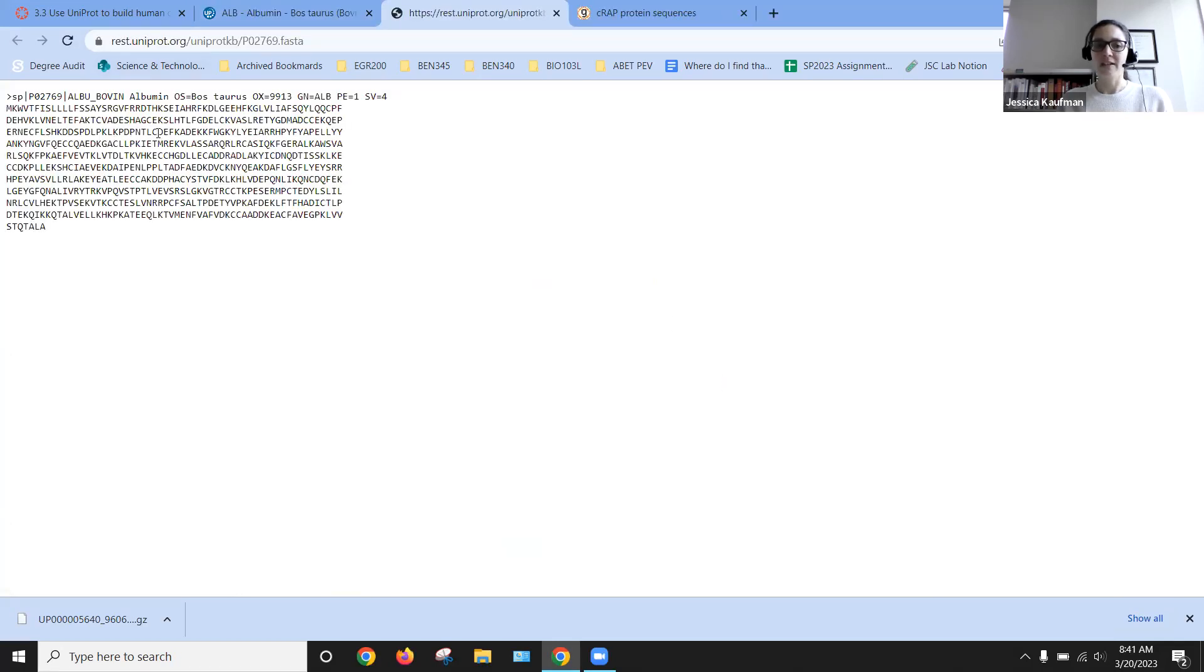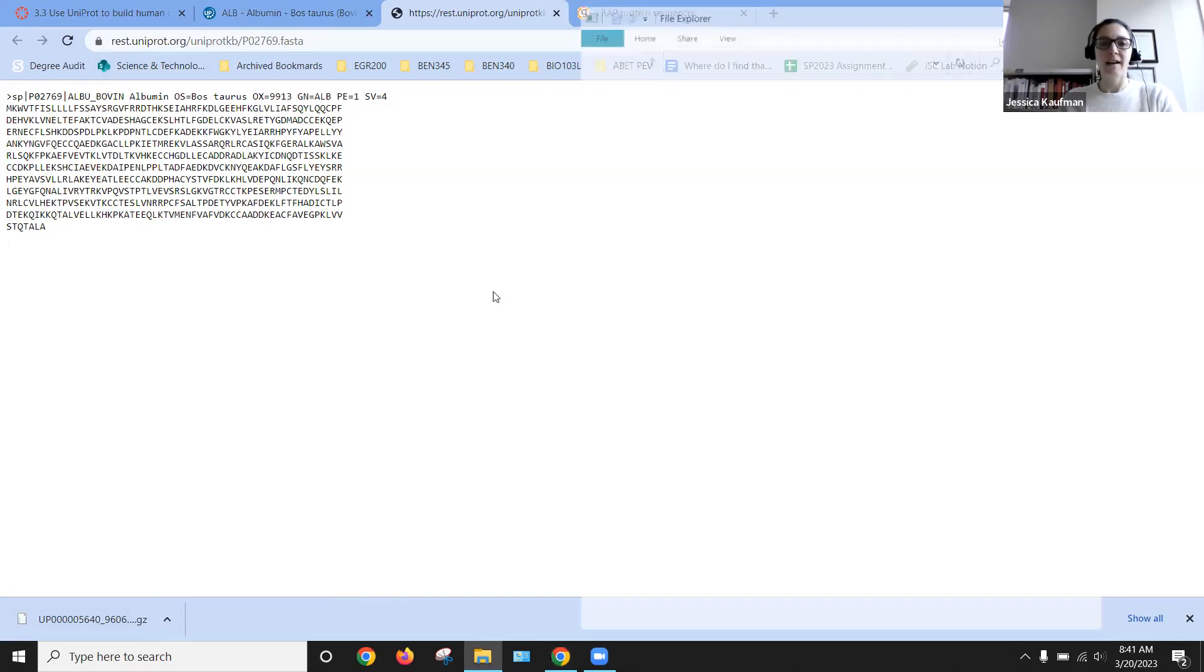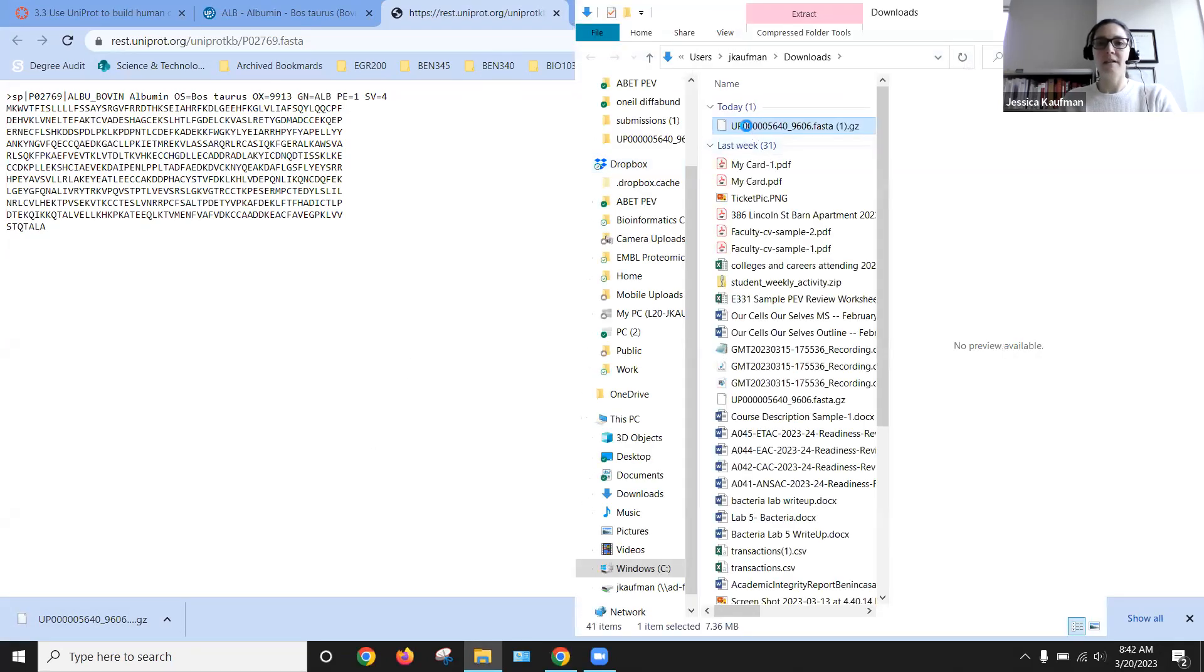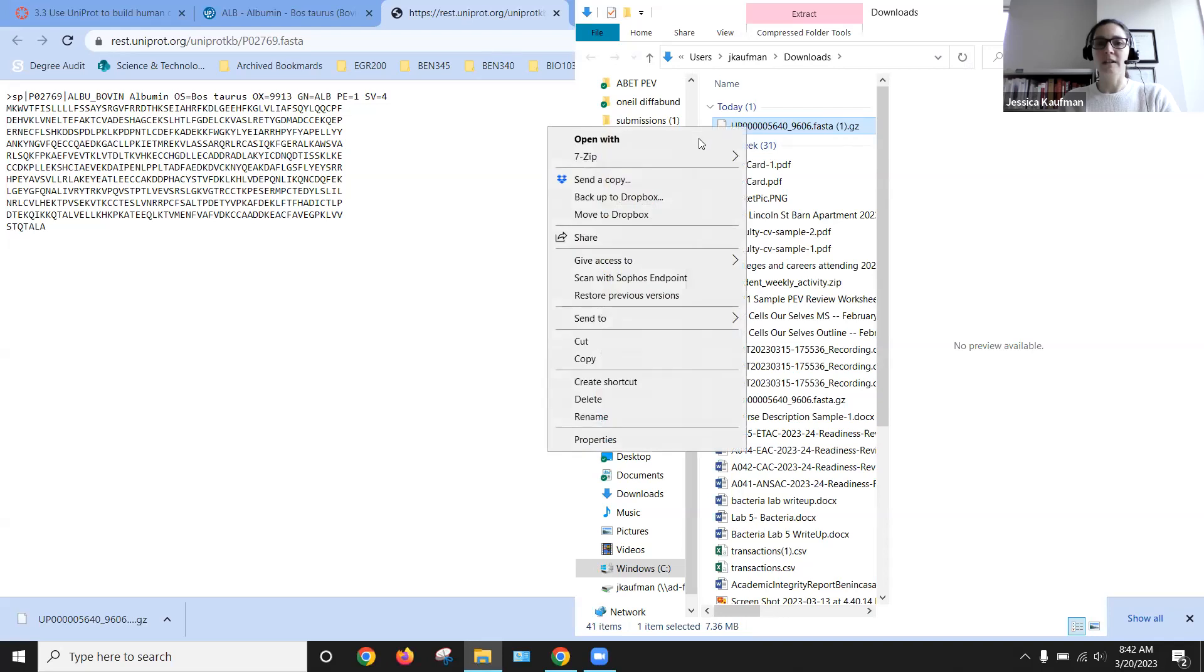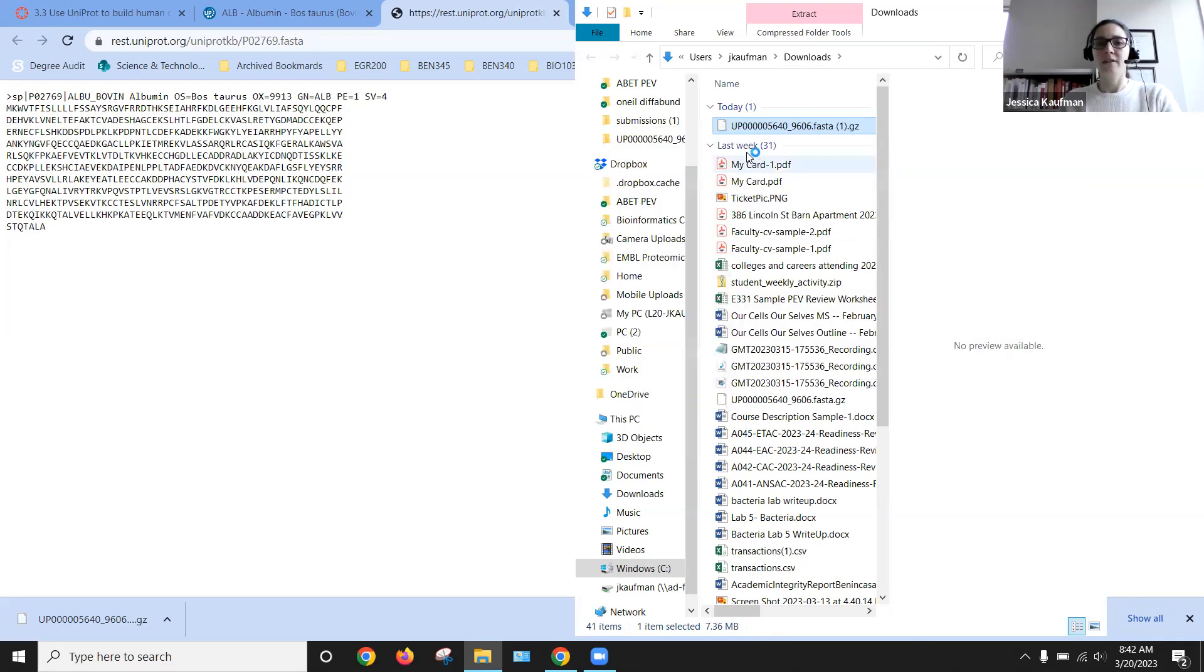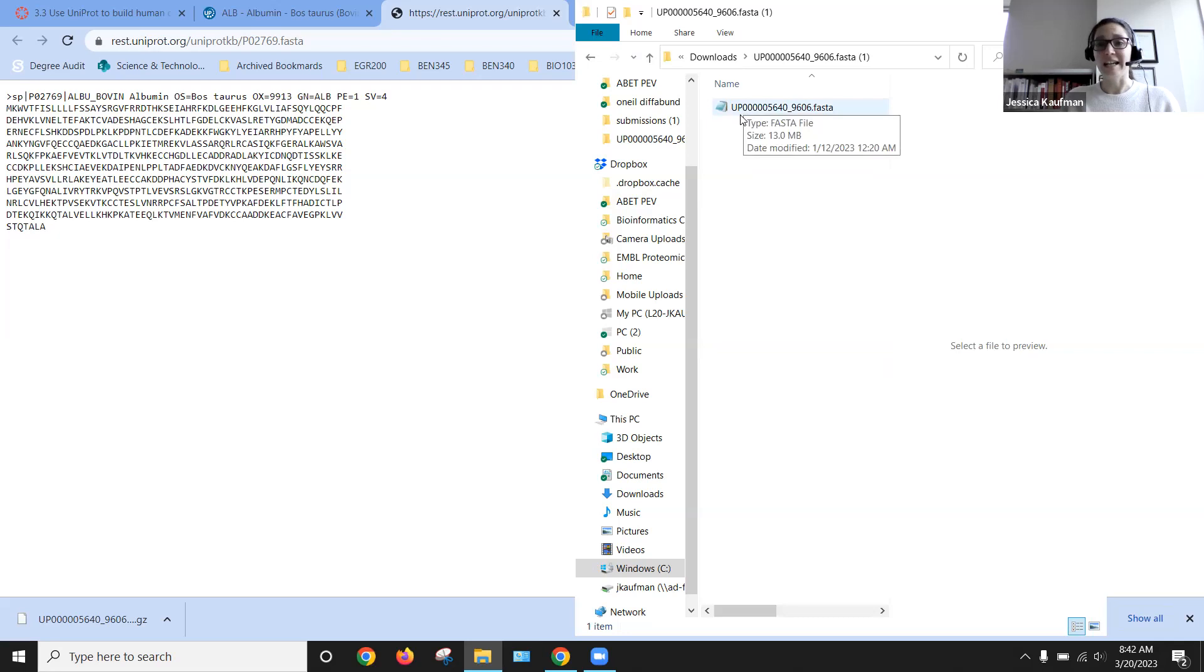And we can download the FASTA file. So we have this FASTA file right here. We have our zipped folder so we can unzip it, extract to a new folder, and open up the FASTA file.